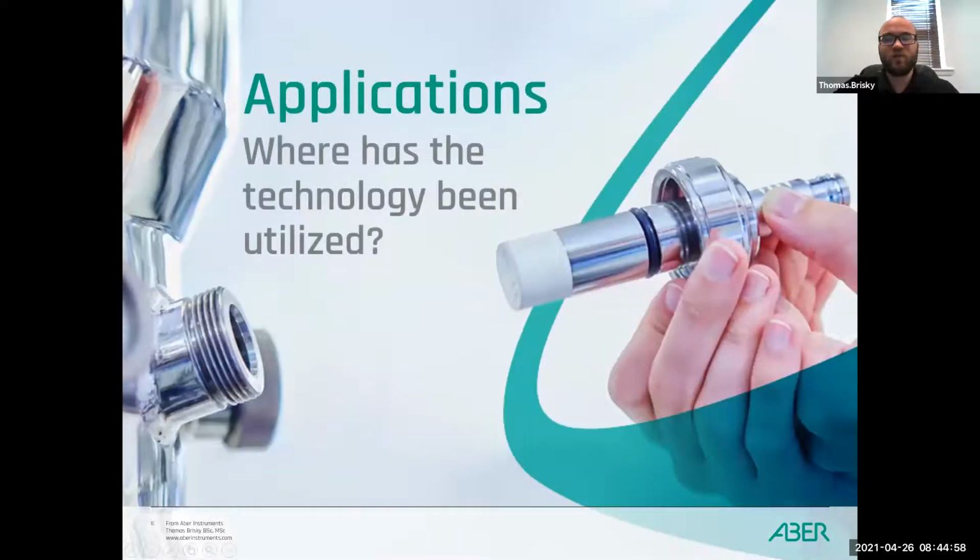So we have addressed 3 of the questions so far: who, why, and how. The final question is where. Where can the capacitance technology be used?